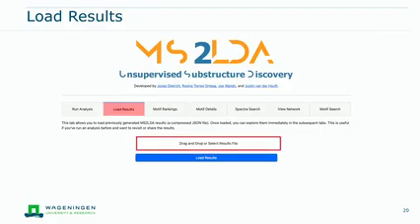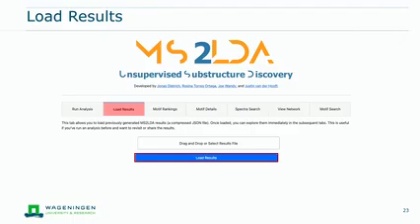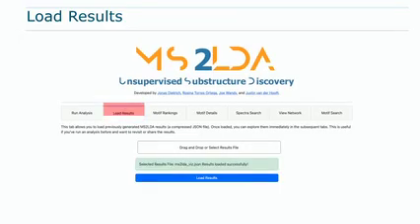The first thing you do is you either drag and drop your file onto this list. It looks maybe a little bit different, no, you're on the server, so that's fine. Or click the button and upload the file you just downloaded, you can use the JSON or the zip file, and then you have to press the load results button again. What you should see if that was successful is a green confirmation that the selected file was successfully uploaded.